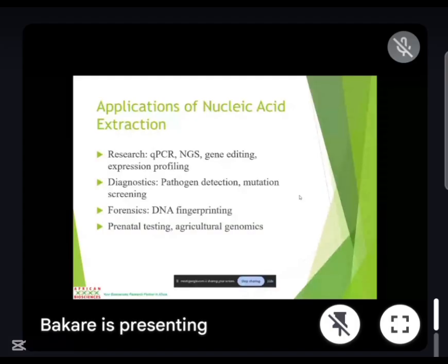Because let's say you want to extract RNA, you cannot use 2 hours extracting RNA. Even before you are done, the RNA will have degraded. You are just wasting your time. So you have to learn speed as well. But while you are learning speed, you also have to know what you are doing, so you won't mistake wash buffer for elution buffer. You also have to know that as well.